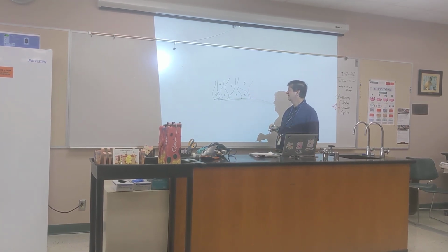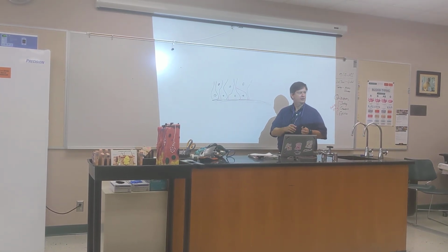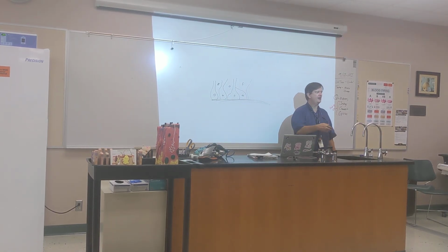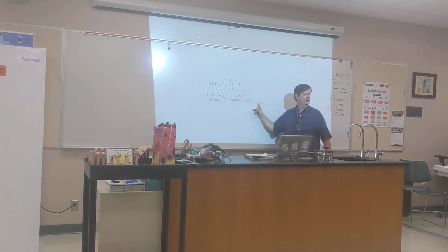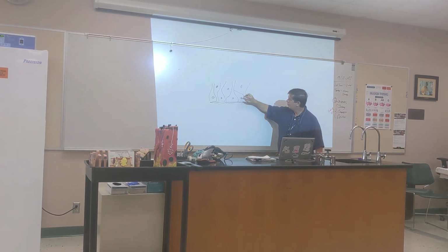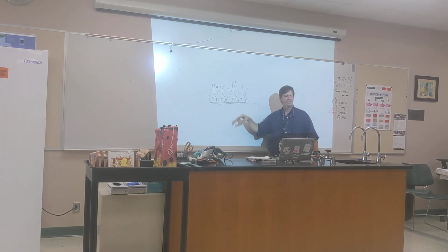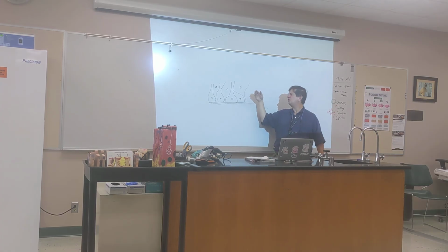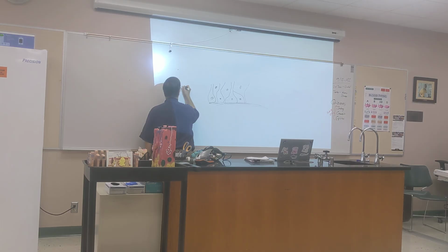Now, you look at this. Suppose you were lousy with a microscope. You didn't know how to focus. You couldn't get the membranes visible very well. You'd see row of nuclei, row of nuclei. You said, that's stratified. It's not. How do you know it's not? They're all attached to the same basement membrane, all attached to that same collagen fiber at the bottom of the tissue, yes? Even ones that don't go all the way up to the apex. These are all one tissue because they're all attached to one layer at the bottom. Good? So you know it's simple. But because it looks stratified, we have a special name for it. We're going to call it pseudostratified.